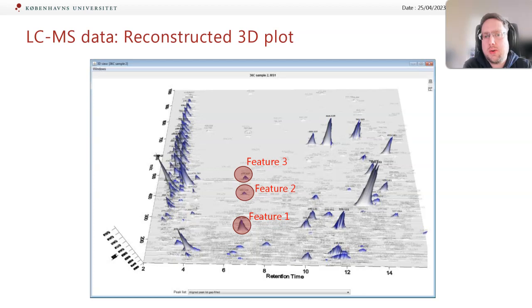So what I will explain now is not really pre-processing, but it is useful to discuss here because we practically perform this analysis right after pre-processing and before statistics. The issue we want to solve now is the issue I mentioned in the beginning with multiple peaks originating from one compound. It means that our peak table will have multiple features for some compounds. That is something that is very nice to know when we do statistics. Are there 100 or 10 compounds that are different between those two sets of samples that we are investigating? That would be nice to know.